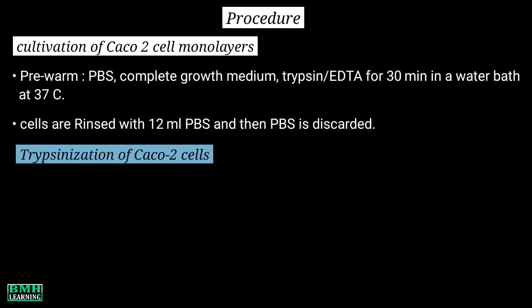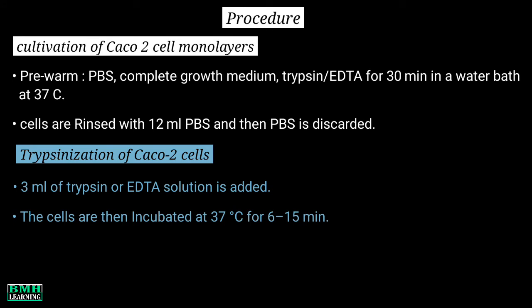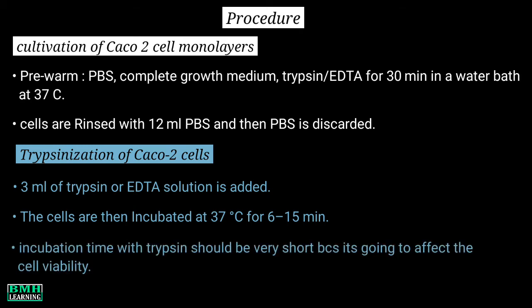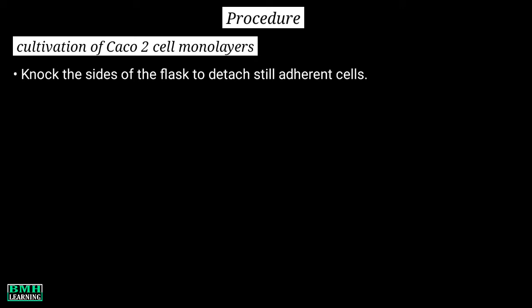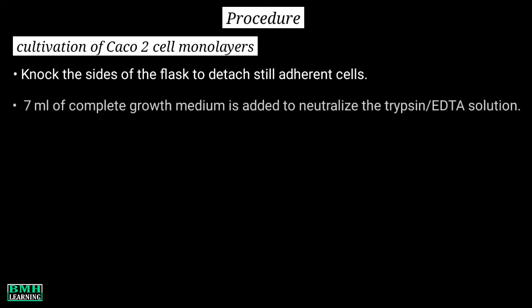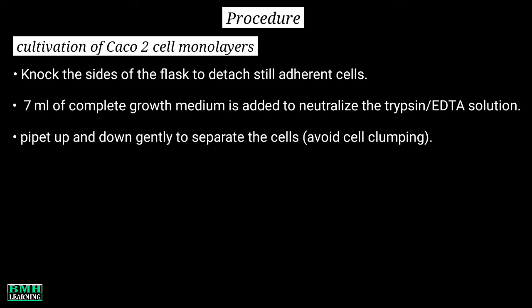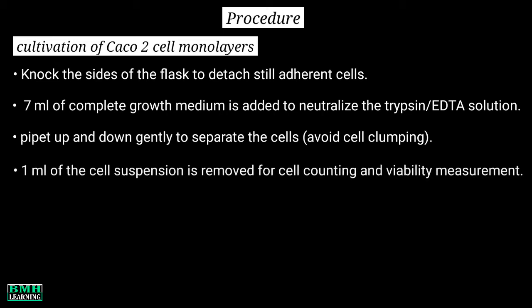Trypsinization of CACO2 cells: 3 ml of trypsin-EDTA solution is added and the cells are rinsed properly in trypsin solution. The cells are then incubated at 37°C for 6 to 15 minutes. The incubation time with trypsin should be very short as it affects cell viability. After this, knock the sides of the flask to detach still-adherent cells. Then 7 ml of complete growth medium is added to neutralize the trypsin-EDTA solution. Pipette up and down very gently to separate the cells, avoiding cell clumping. 1 ml of the cell suspension is removed for cell counting and viability measurement.